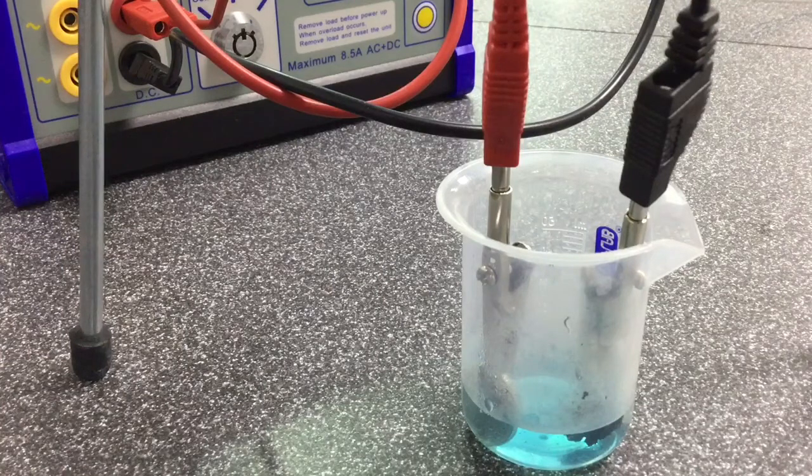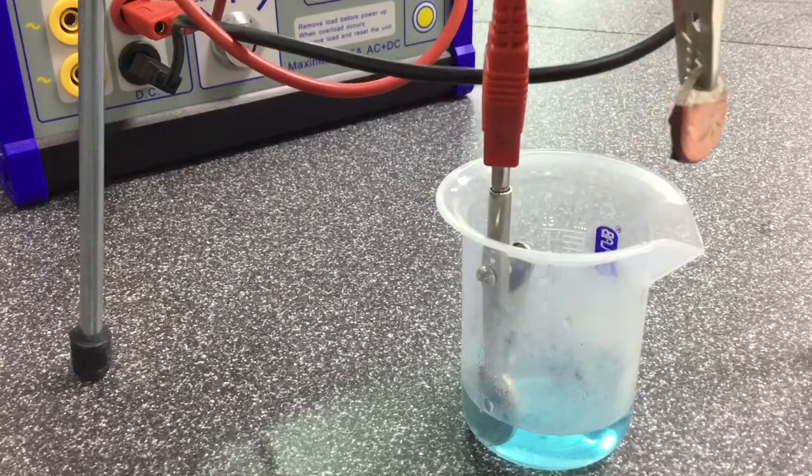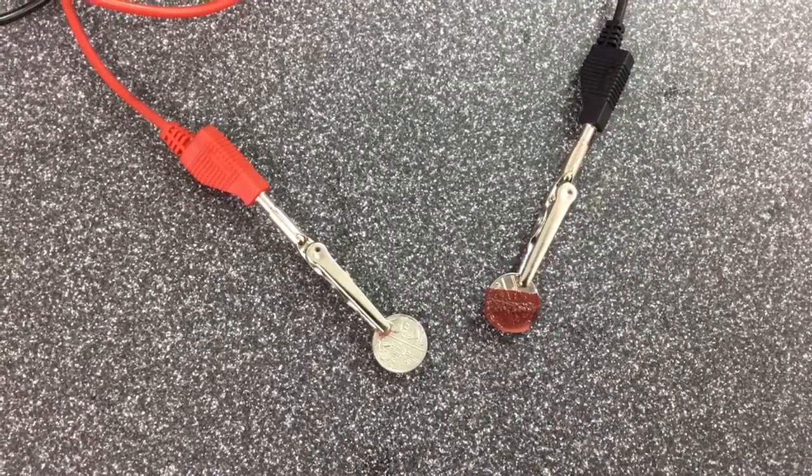Here the 5 pence pieces act as the anode and the cathode, and you can clearly see the buildup of copper on the cathode 5 pence piece. This can be used to improve the properties of objects as well as improve the appearance of jewellery.